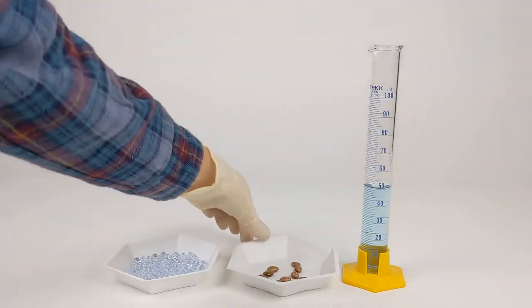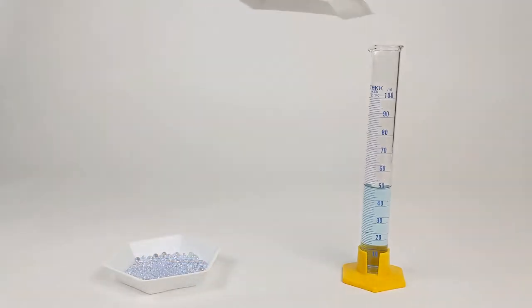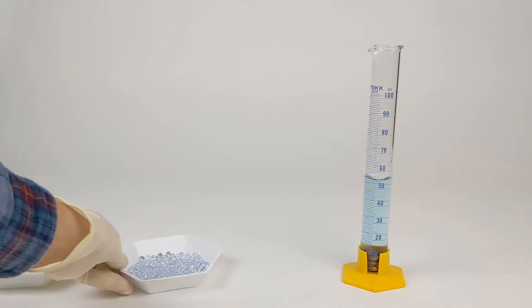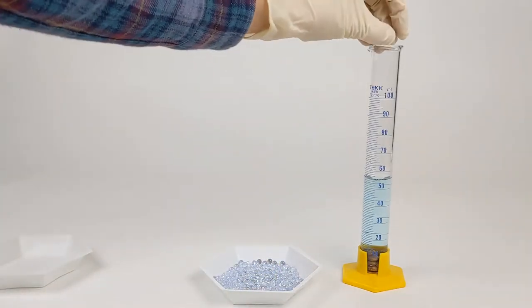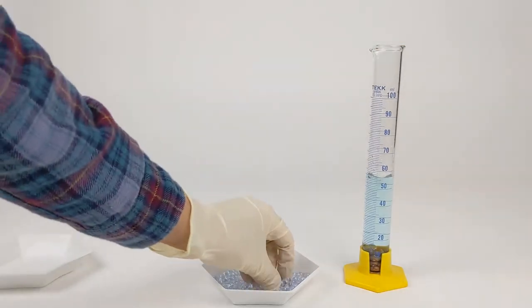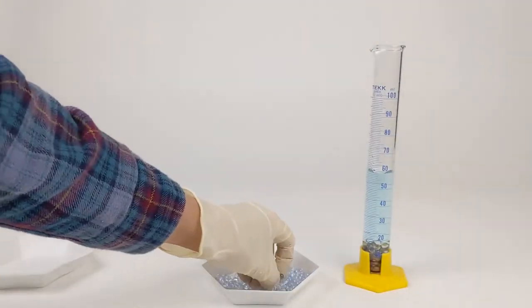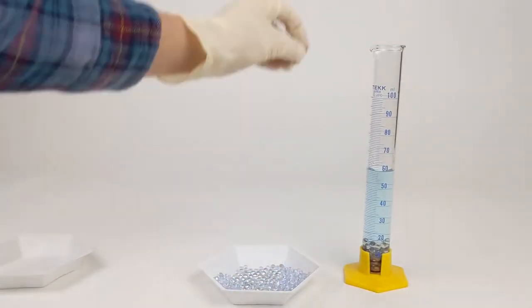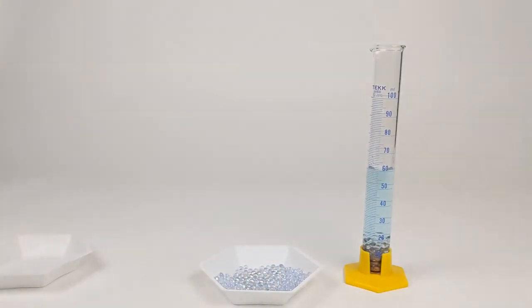Now we're going to measure out the contents of the non-germinating bean vial, which includes non-germinating beans — 15, the same number as germinating beans — and glass beads. The glass beads will be added until we've displaced the same amount of water that we did with the 15 germinating beans. So we're adding glass beads until we get to 61 milliliters, which is 11 milliliters of vial contents.